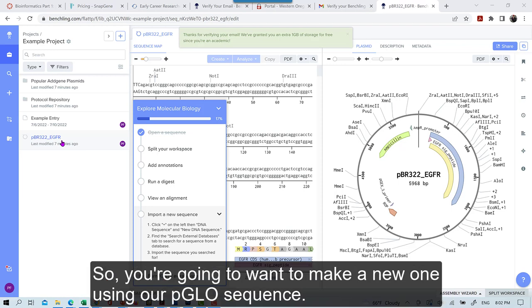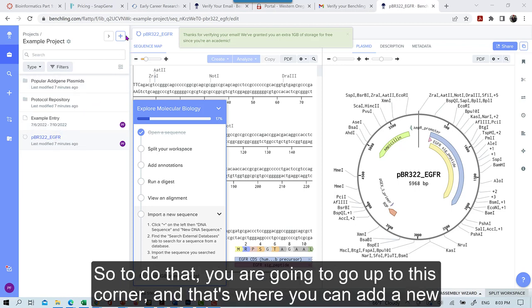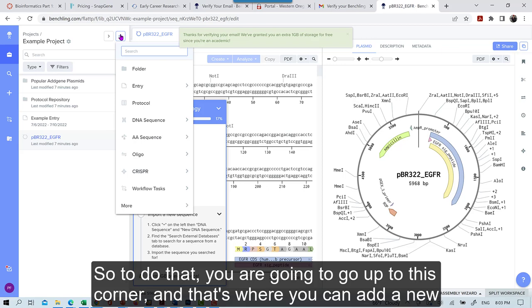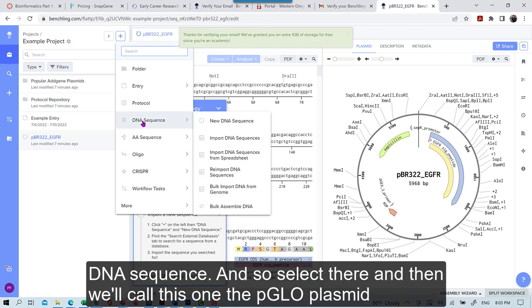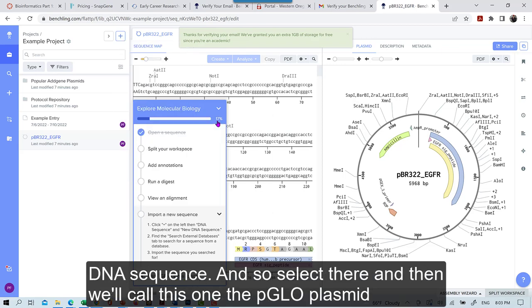So you're going to want to make a new one using our PGLO sequence. So to do that you're going to go up to this corner and that's where you can add a new DNA sequence. And so select there.